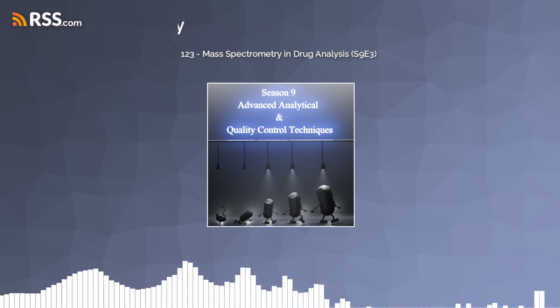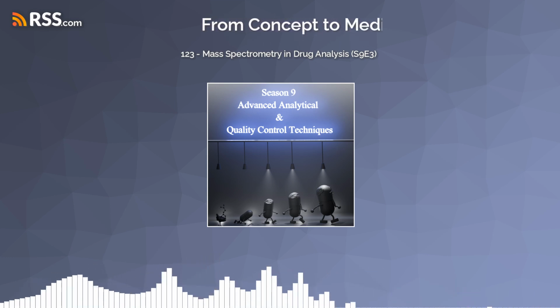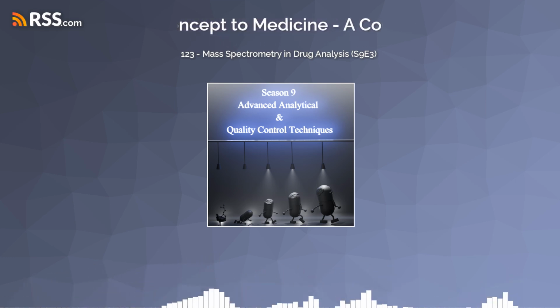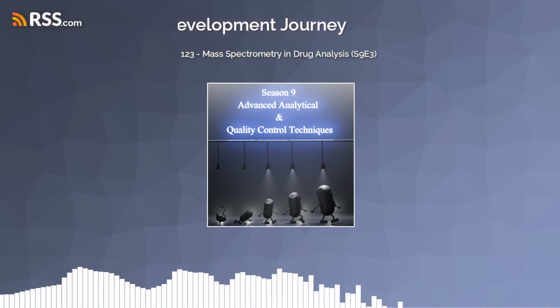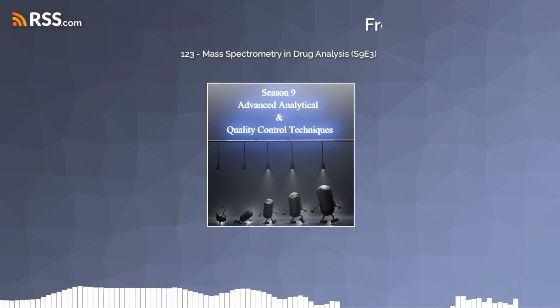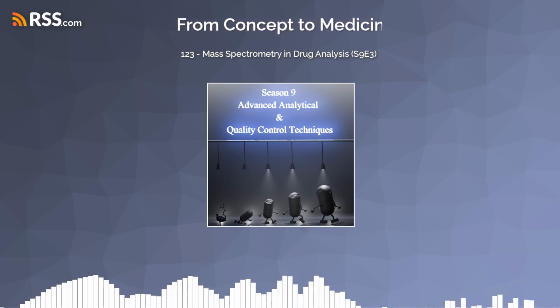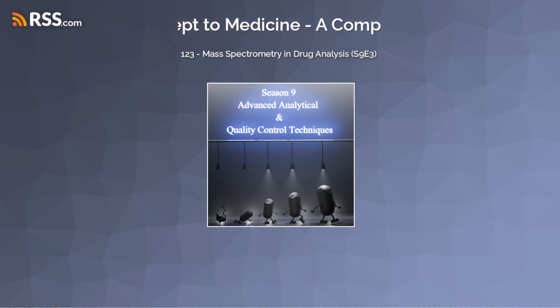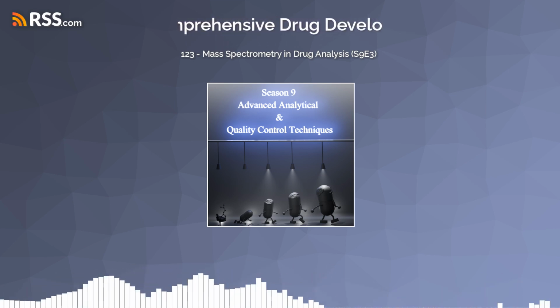Right. Because what we don't see are the unseen molecules that might be lurking even in those carefully manufactured drugs. Exactly. And that's where a powerful tool comes in, a kind of molecular detective, if you will. And that's mass spectrometry. So for this deep dive, we're going deep into the world of drug analysis to uncover exactly how mass spectrometry works its magic. We'll be looking at how it dissects the main drug substances themselves and, importantly, uncovers even the tiniest traces of impurities that might be hanging around.